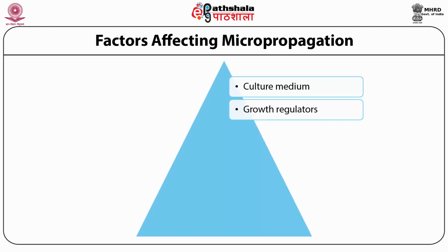There is no relationship between the requirements of the plant outside versus what it requires in cultures. So tissue culture is more of an art. You start with broad categories, low salt, medium salt and high salt, and then you decide on what kind of media constituents the growing culture requires. MS media is most widely used, but it is not universal. For woody species, we also use different concentrations of MS. We reduce salts, both major and minor.